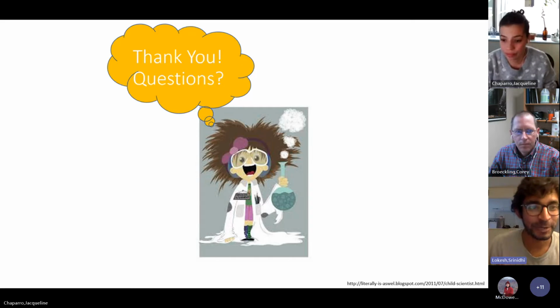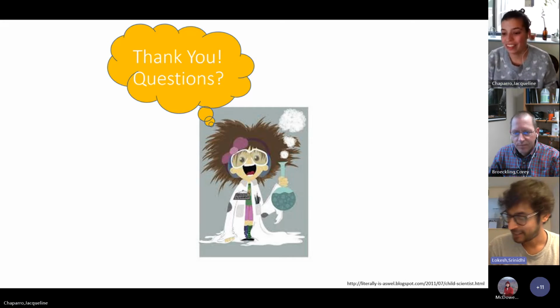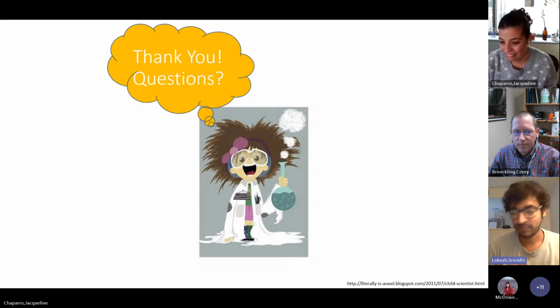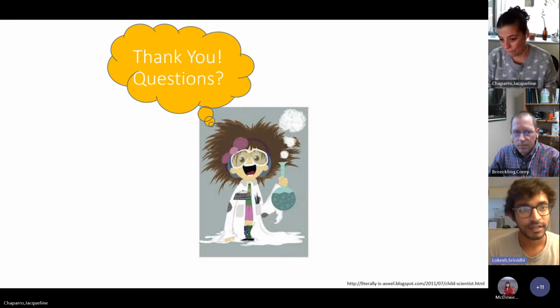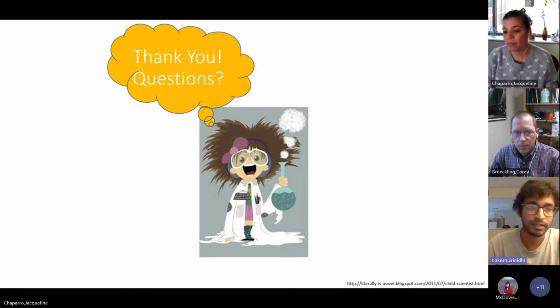Hi. Hello, Dr. Chaparro. Wonderful presentation. That was really amazing. And I know through the seminar, you really spoke a lot about the interferences. So my question was, can there be detection beyond the nominal mass on these instruments, or is the whole thing for ICP-MS that you just don't go beyond nominal mass?